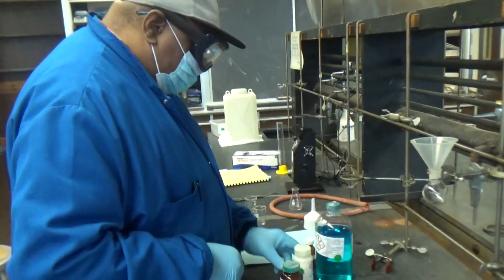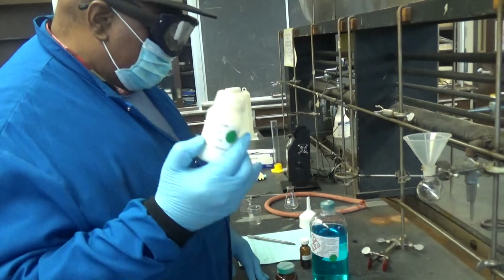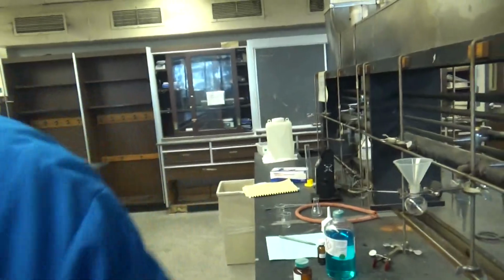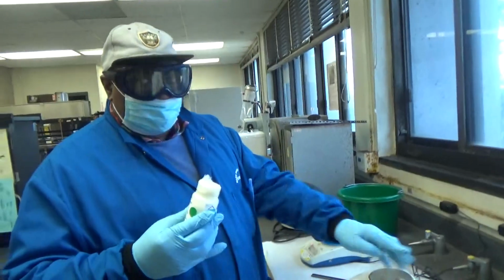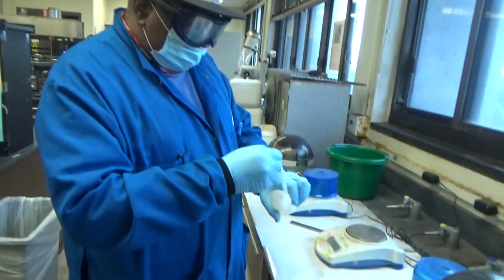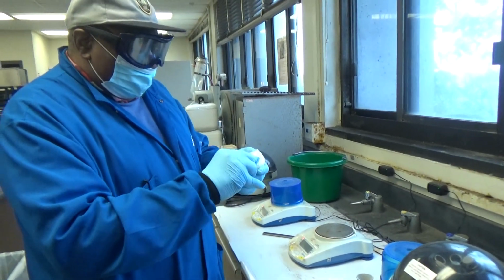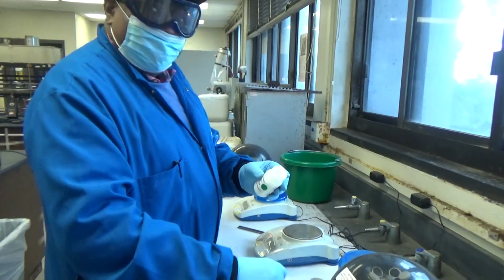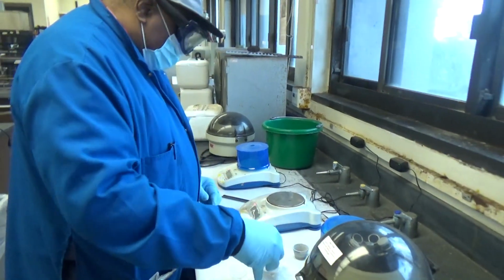Now you are going to add first 0.4 gram of ammonium nitrate, that's 400 milligrams. This is not good stuff, as you know. Under the right circumstances it's explosive, but this one has a little bit of water, which makes it less explosive.